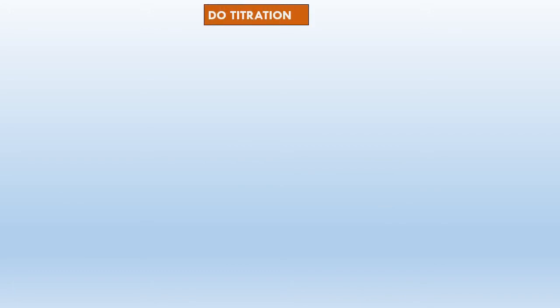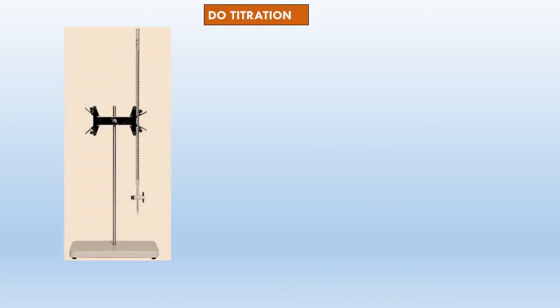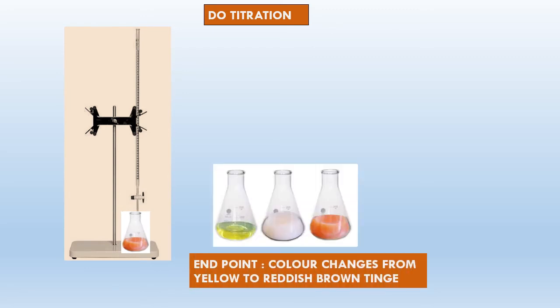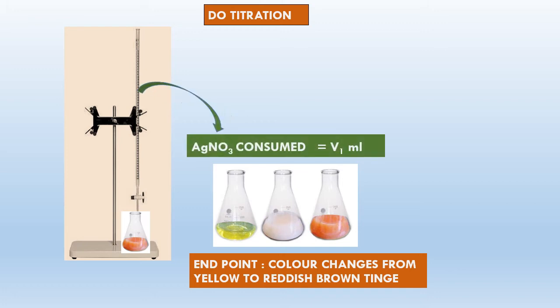Let us do the titration. We have the burette filled with AgNO₃ solution and we are going to titrate now. Upon titration, the color changes to reddish brown tinge — that is your endpoint. Initially the solution is clear yellow, then you have the silver chloride precipitate forming, and then it turns to reddish brown tinge.